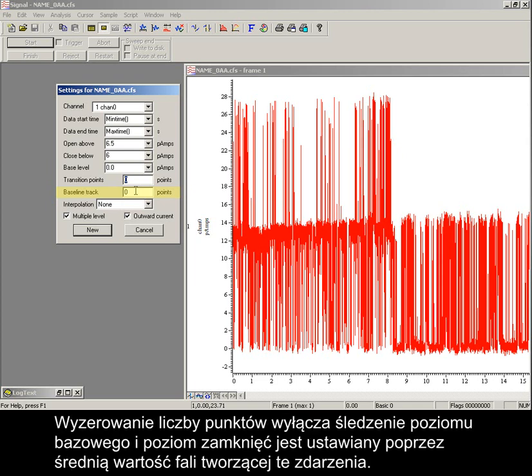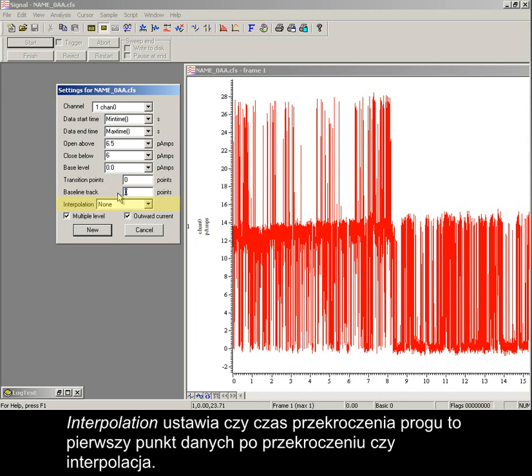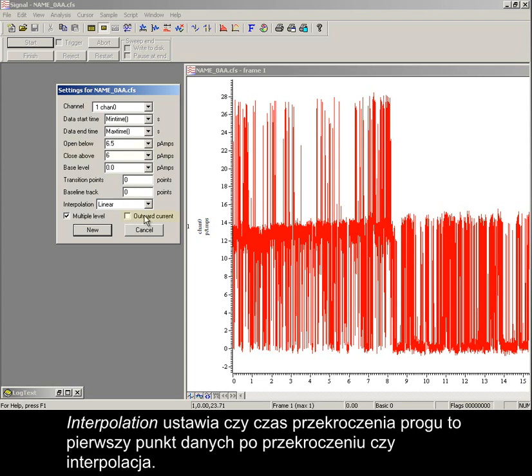Zero disables baseline tracking, in which case the level of a closed event is set by the average value of the waveform making up this event. Interpolation sets whether the threshold transition time is the first data point after the crossing, or interpolated.